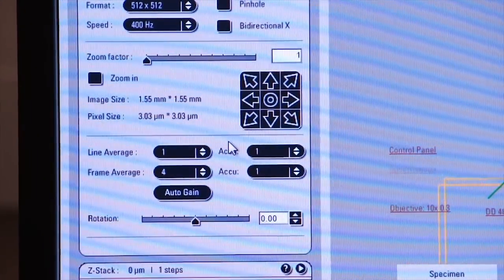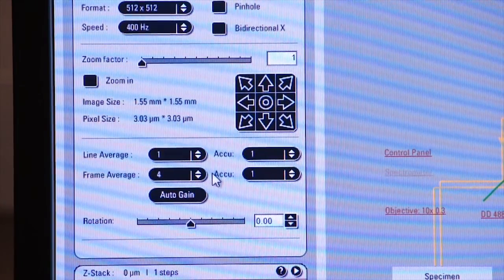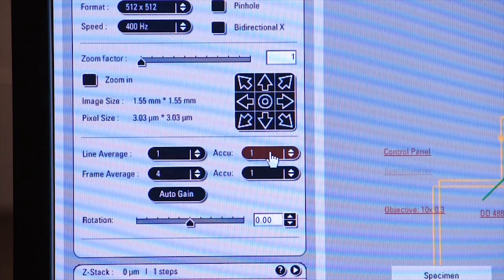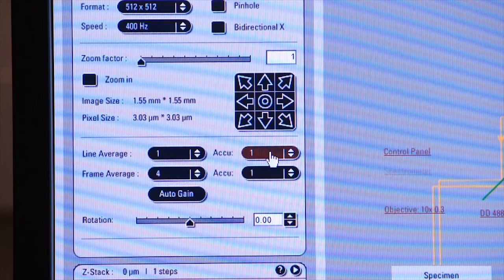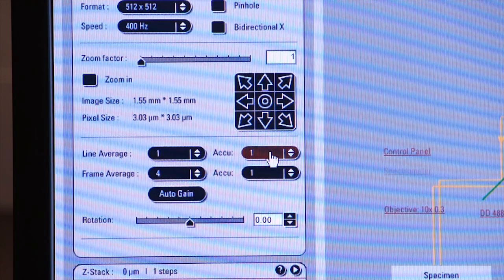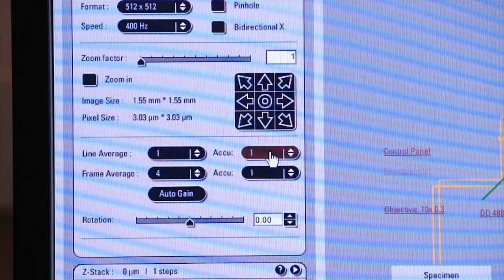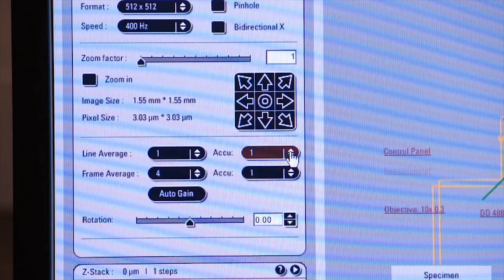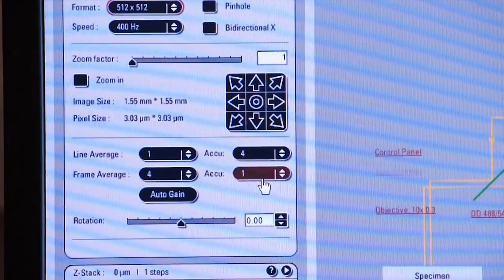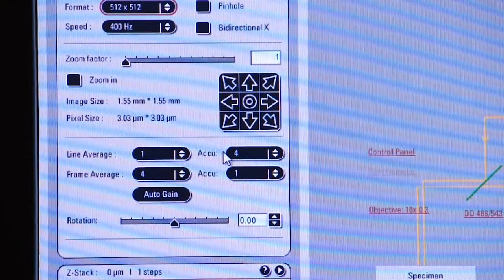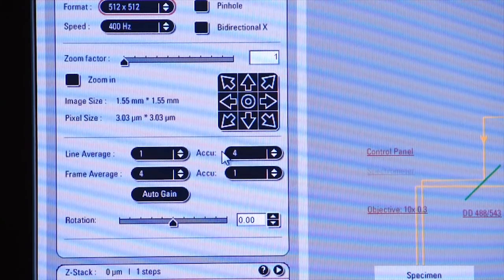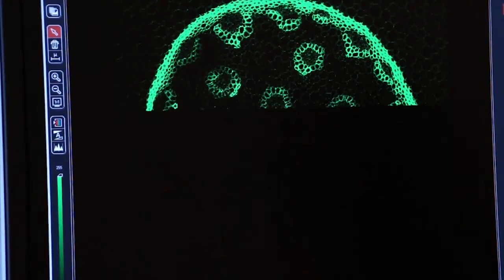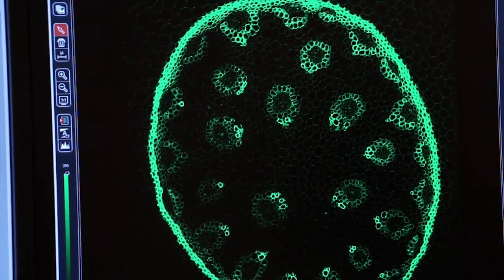Another feature that's useful on the left screen next to line and frame average is the accumulate tab. Accumulate takes an accumulation of each scan if you have a low signal image and you want to boost the brightness of that image. So here I'll select four. And now I've told the system to do four line scans per line and to accumulate or add together all of those values. Now if I click on capture image, you'll see my image brighten up significantly because it's accumulating each one of those scans together.